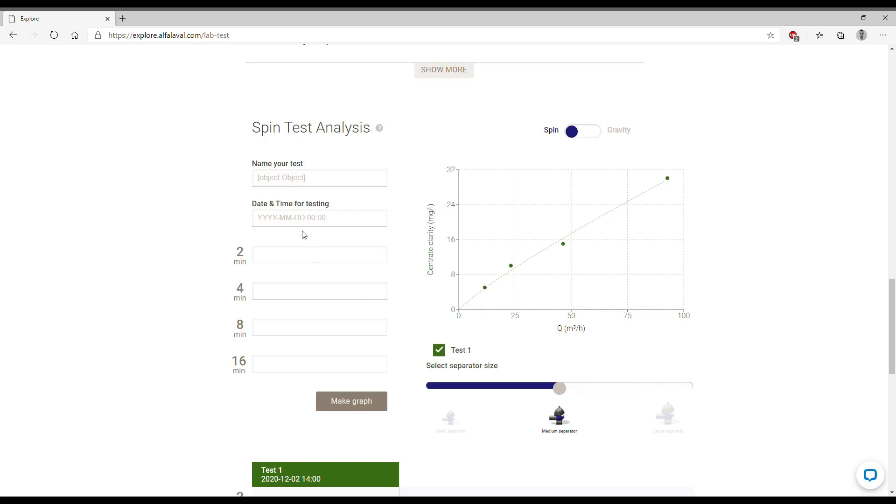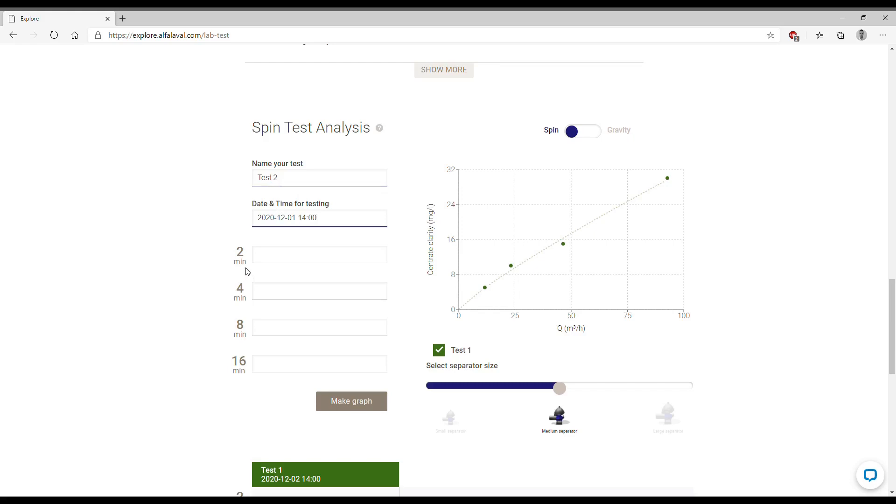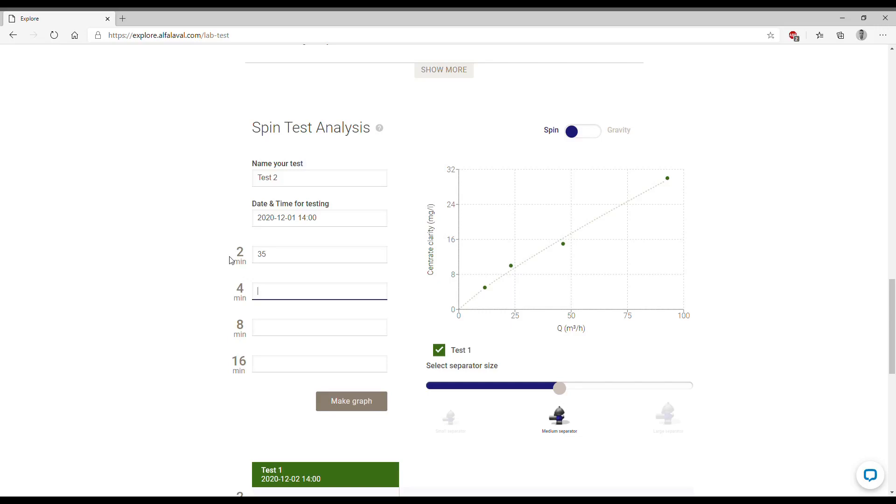We can also enter another test if we have more points. We can add them to this curve and see how they correlate between each other. So let's assume that we repeated the same test just one day before. Instead of 30 mg per liter after two minutes we can assume to have 35, then instead of 15 we can assume 17, 8 and 2 just to see how the curves look like.